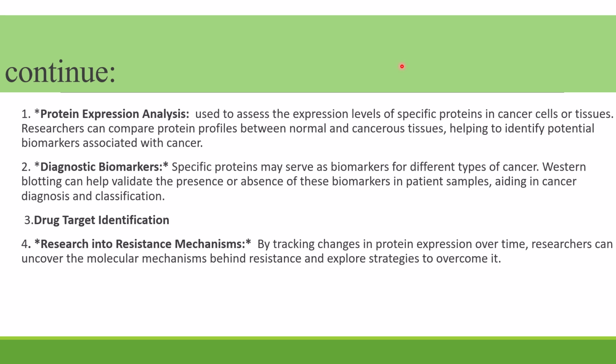Suppose you want to check, in cancer research, what protein is higher in these particular cells. Or suppose you are treating someone, you have a patient sample or a tissue sample that is basically taken from a cancer tissue, and you want to check, okay, this particular protein is higher, suppose P53 is higher in the sample. Okay, so P53 is higher or P53 is lower.